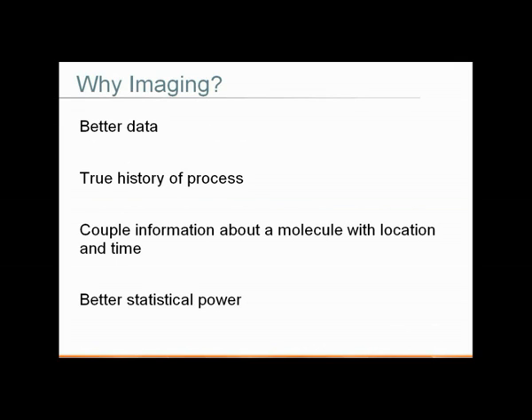The question often comes up, why do we want to conduct imaging experiments in general? First of all, you can utilize whole tissue imaging, such as you get from the MSFX Pro, to get better data out of your microscopy or in vitro follow-up experiments, because you can visualize the molecular events that are occurring at the entire tissue level and then just sample the most relevant areas for your microscopy or histology or Western blotting or deep sequencing applications.